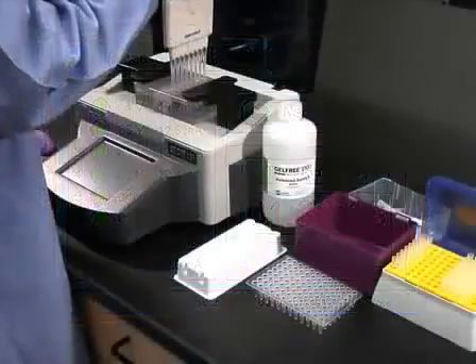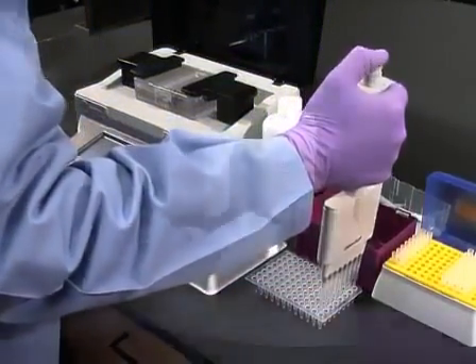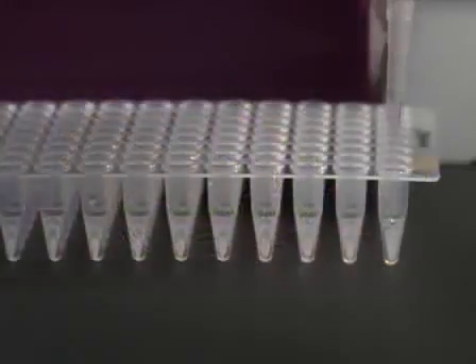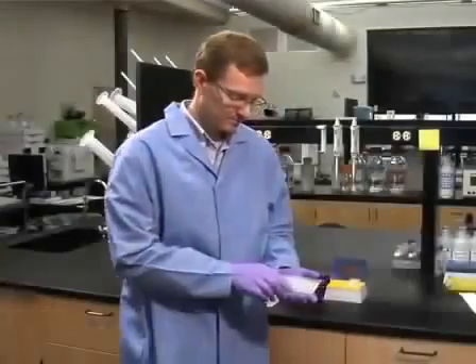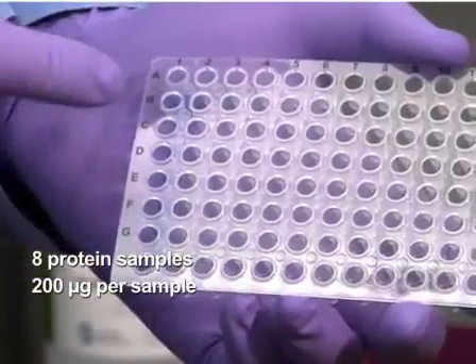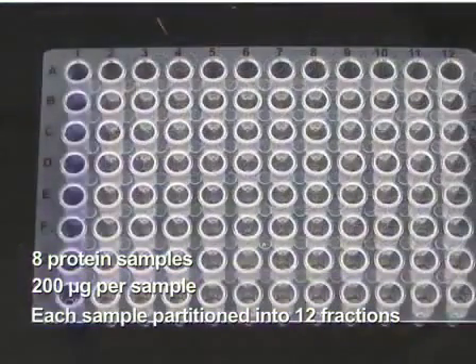Once all of the fractions have been collected, they can immediately be used for further downstream preparation, such as isoelectric focusing or gel electrophoresis, or for analysis using liquid chromatography. In this demonstration, 8 protein samples at 200 micrograms each were partitioned into 12 fractions each for a total of 96 fractions.